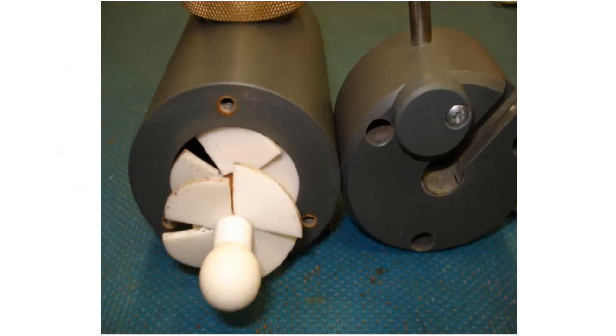This image shows the mixing chamber, which is where a large number of the device's mechanical defects belong, and it needs service occasionally.